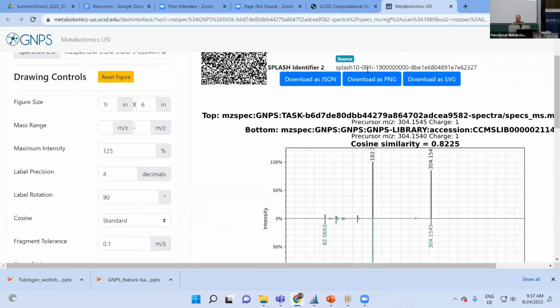Oh, the scores. Yes, good question. Good that we didn't miss it. The thing is, this interface uses different filtering and also a different implementation than GNPS molecular networking. So it's kind of sad that we don't get the same scores, but here it's actually a process done on demand. So you can change the spectra that are used to any spectrum that's in the public domain. That is on MetaboLights and MassIVE and on GNPS.